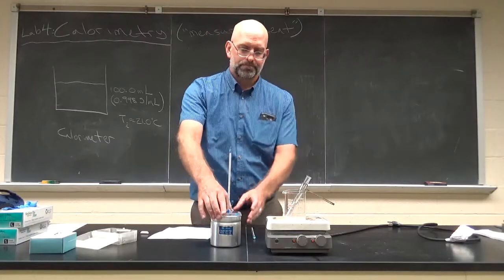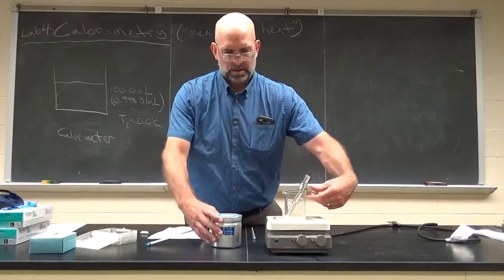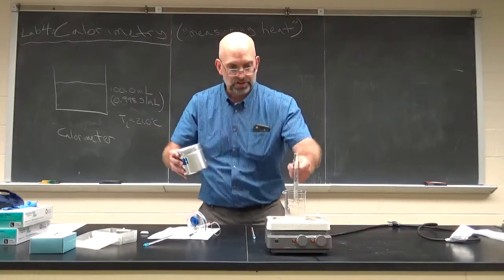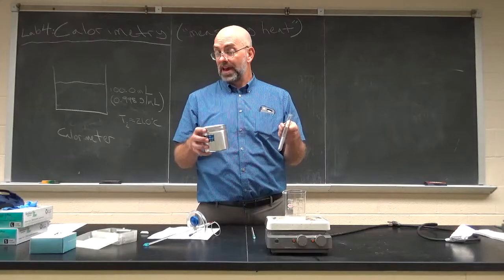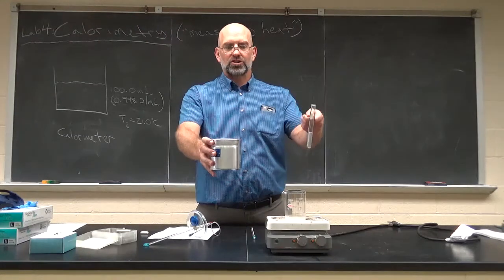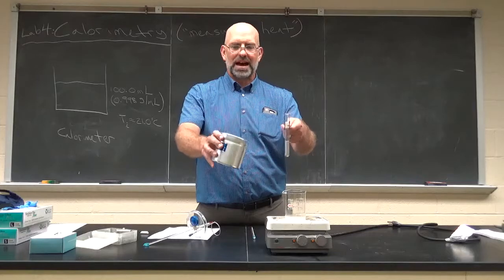So then what you do, this is a little tricky, is take that out. You want to get this piece of aluminum into this room temperature water as quickly as possible. As soon as you pull it out, it's starting to cool down. That's a big source of error, not transferring it fast enough. Again, I'm not going to do all of this. So you've got your water, you've got your aluminum cylinder. We may adjust the volumes in here. It doesn't really matter too much.